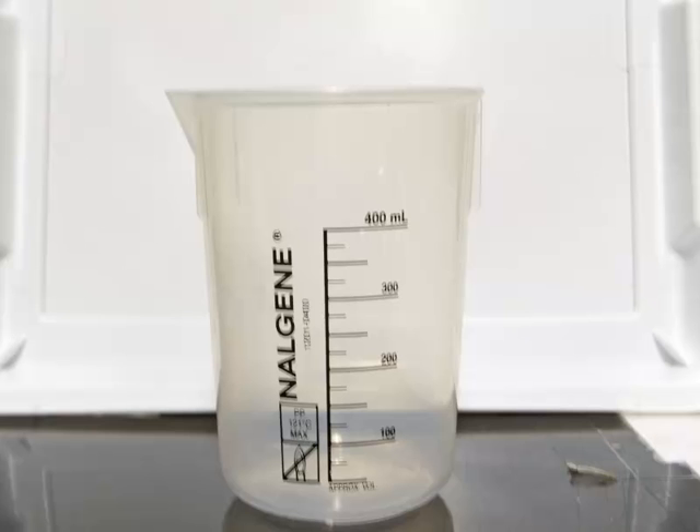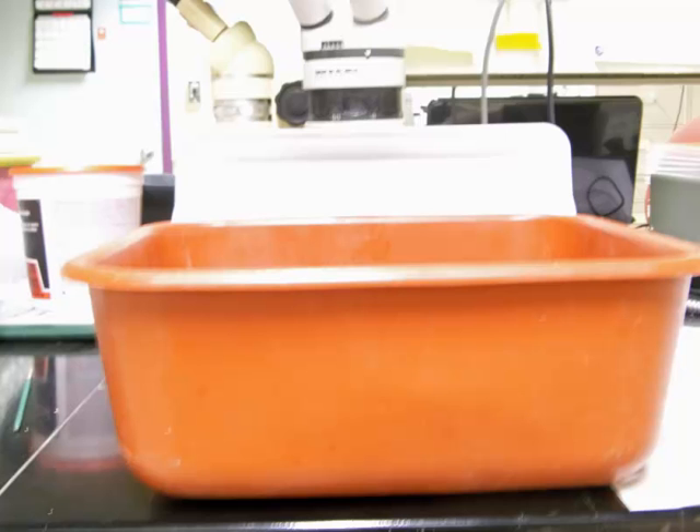You also need a container to collect your IJs. You will wash them using non-chlorinated water into a measuring cup of 16 ounces or larger, a large bowl, or a large Tupperware container — anything that will hold a significant volume of water, which must be non-chlorinated. In a pinch, dish pans also work very well because they can hold a lot of liquid.